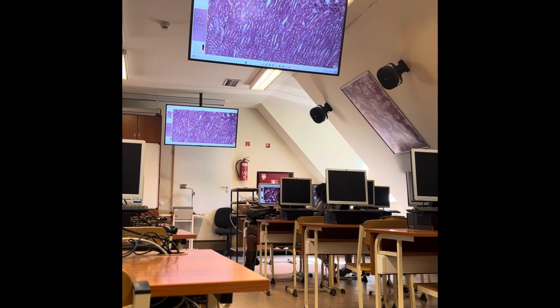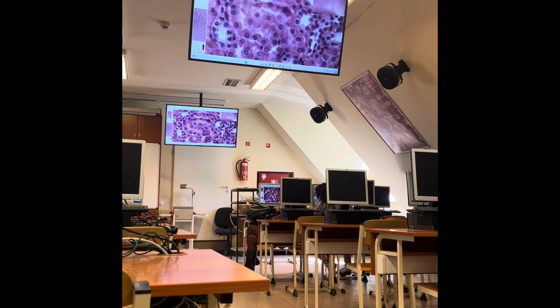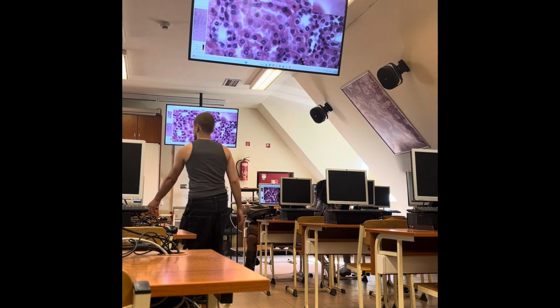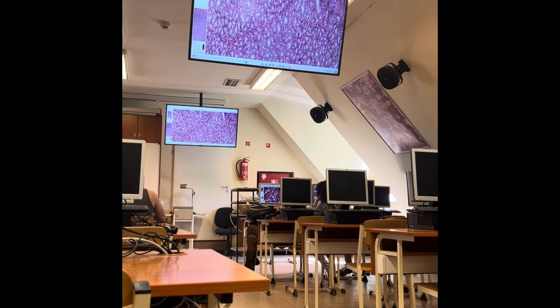Now we enter the medulla, and there are gradual changes in the lining epithelium. So it becomes shorter. This is still showing the typical morphology of the proximal tubule. These are all straight segments, what we find in the medullary part. And then it continues into the thin segment of the loop of Henle.